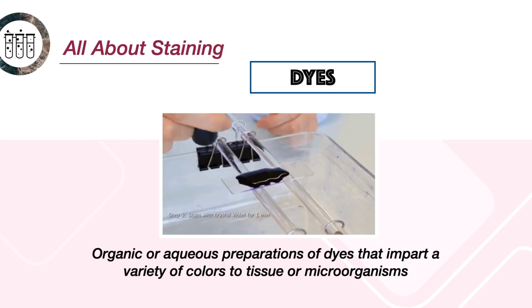In order for us to study the structures and to differentiate the bacteria into specific groups for diagnostic purposes, we have developed biological stains and also the staining procedures in conjunction with light microscopy, so we are fully equipped with the major tools in microbiology.